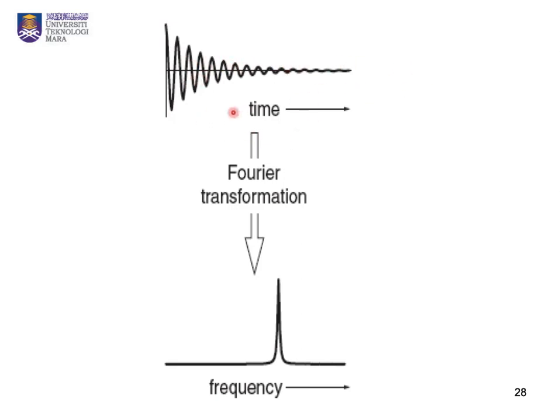This is the time domain spectrum, and usually the spectrum is recorded like this. This time domain is converted into the frequency domain through Fourier transformation, because the time domain spectrum is not possible to read.